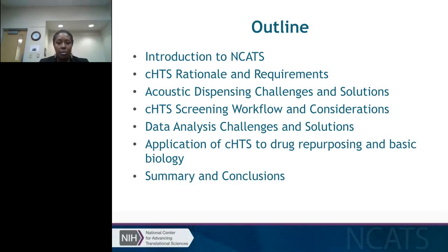So the talk that I'll be giving today is just a brief outline. I'll give you a brief introduction to NCATS, the institute at the NIH I work at, for those that don't know about it. Then I'll talk about reasons why you may want to implement combination high-throughput screening, or cHTS as I'll refer to it today, and the requirements that you would need to implement this type of platform in your own institution.